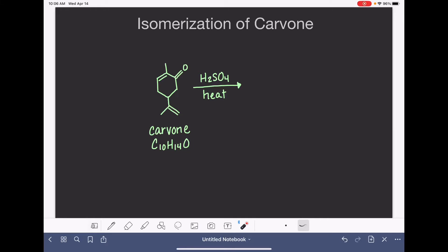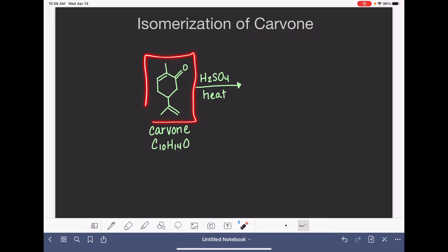In this experiment, I'm going to perform an isomerization on a molecule called carvone. This is the carvone molecule. Its formula is C10H14O.